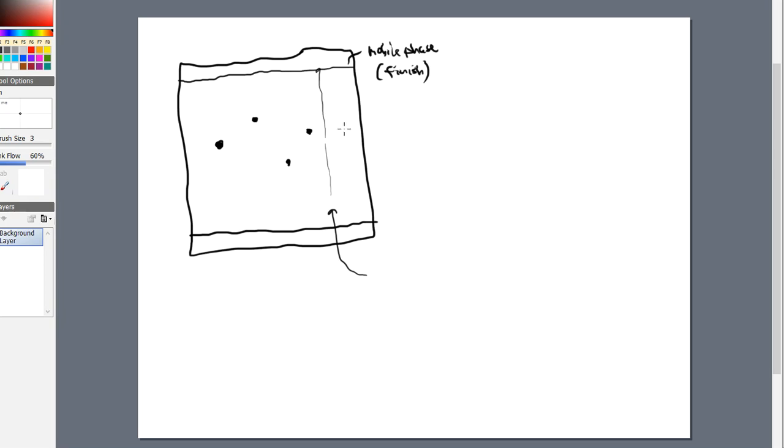So at the end of this lab, what we'll end up doing is that we will calculate something that we call a retardation factor. Okay, now I've got to say something here. Retardation factor has been used for a number of years, and we've just assumed that we'll keep calling it retardation factor, but some people have been offended by this term. So retardation factor, we abbreviate it as RF, and then we call it RF factor. That's what the R stands for. It's what it stood for years and years.